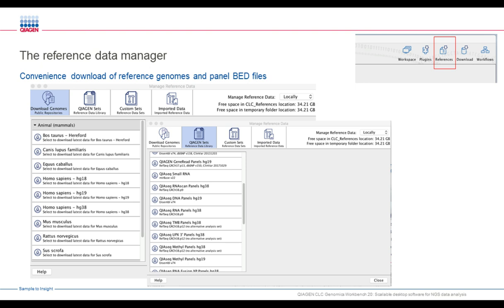The Reference Data Manager allows you to repopulate your reference data by selecting and clicking on the reference data you are most interested in and downloading it to your hard disk. For panels, we offer a variety of panel-specific BED files that go with the workflows.